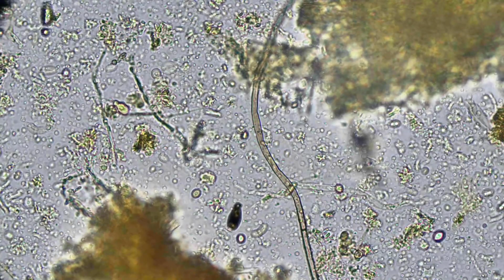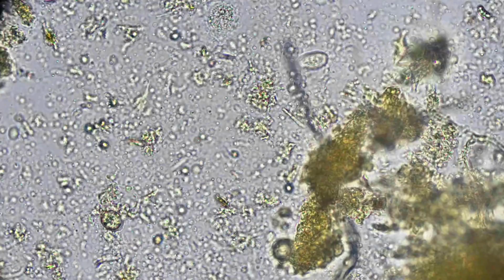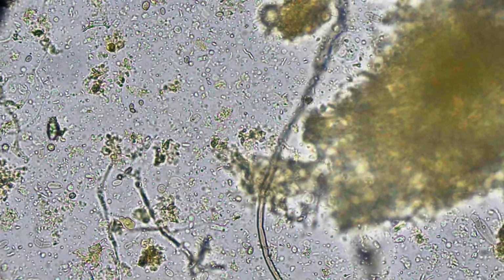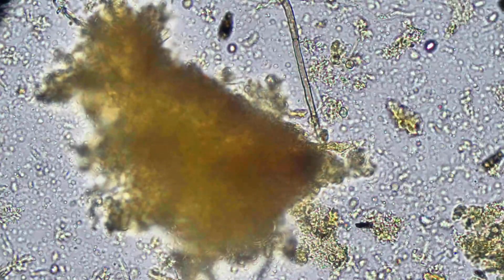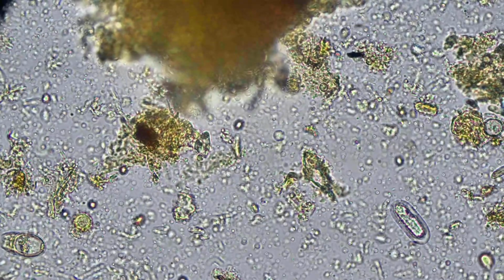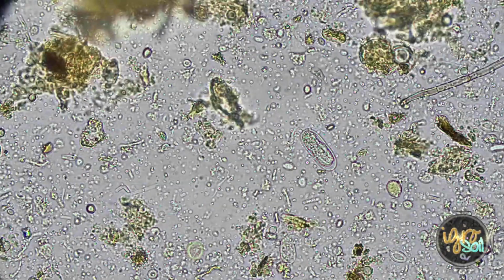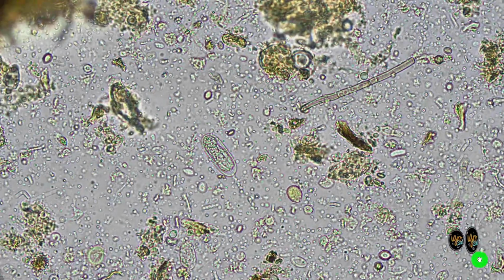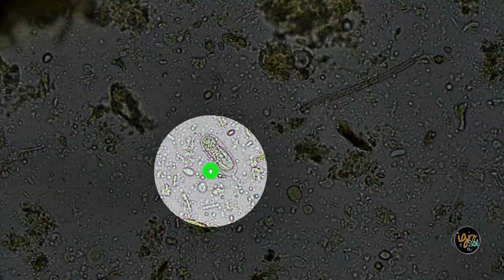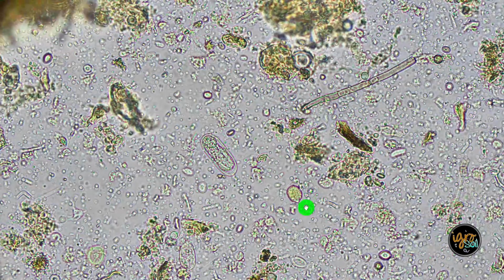Right, we got the clear septa there. We've got the uniformity. We've even got that brown color. And I wonder, if I remember, that's some type of indication of, I don't know, humic acid. But there's no doubt about this thing being humic. This is a great shot. If I took a screenshot here, you've got something there. Don't know what. You've got a beautiful piece of fungal hyphae here.